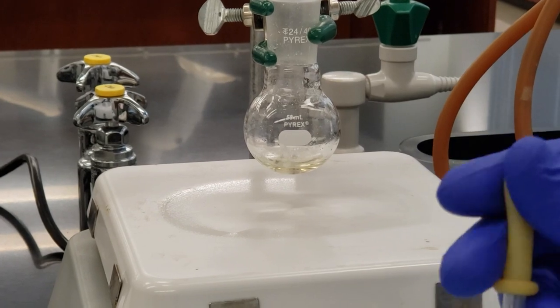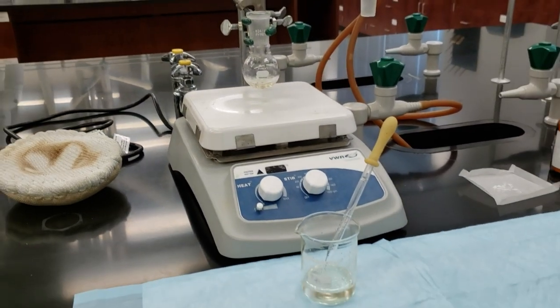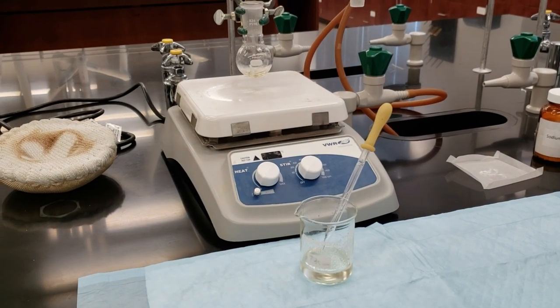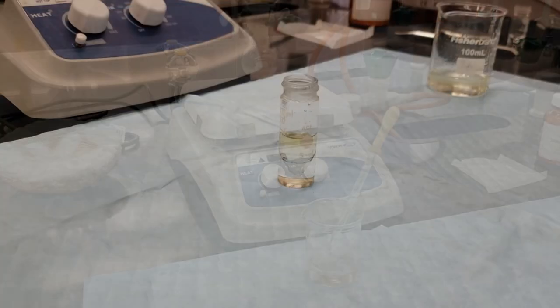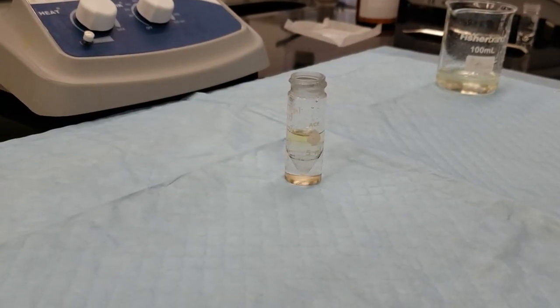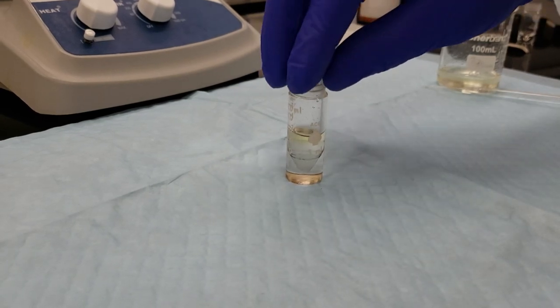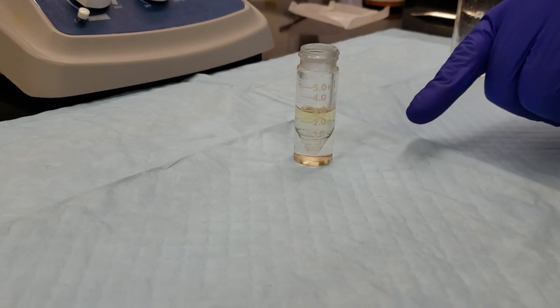Okay, I've removed enough of the aqueous layer, so we should be able to fit it into the conical vial. I'll go ahead and do that transfer, and then we'll come back once we're ready to do the final microscale extraction. I've transferred out the remaining solution from our round bottom flask, and when we get it into a small container like this 5 mL conical vial, it's a little bit easier to see the separation of the layers.